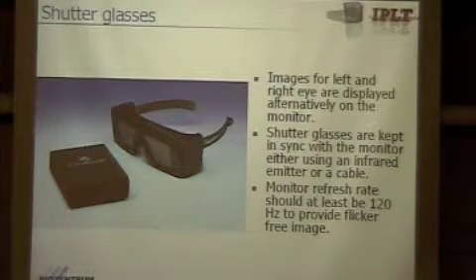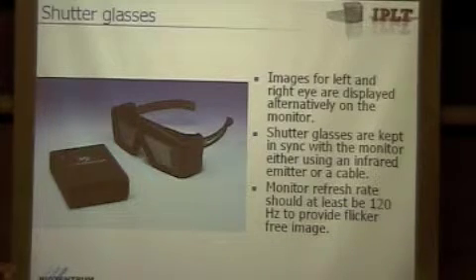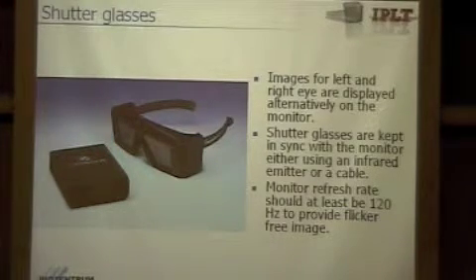We actually had a TFT screen demoed about 3 months ago that works with this setup. Okay, so they're starting to come onto the market. Yeah, and it worked, I mean, it's comparable to CRT. Okay, that's cool. Because until recently, this was the main drawback, that you really needed one big old CRT monitor to do that.